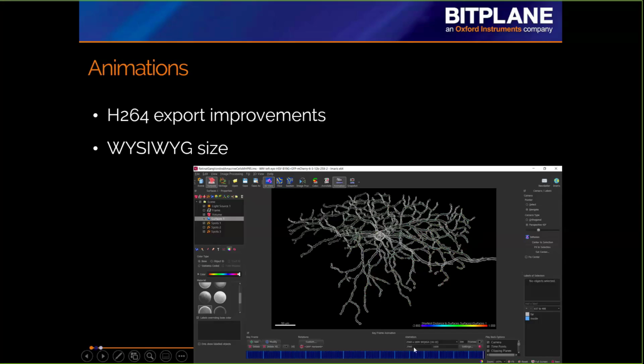And we also gave many different predetermined pixel sizes for the height and the width of the screen for the animations, because over the course of time, our entire team, so I want to shout out to support here, found that using these specific sizes works better, not for the export necessarily, but really for the playing of the exported animations within the viewers.